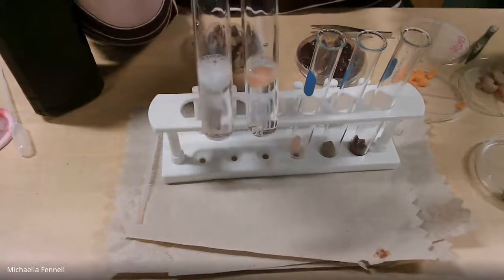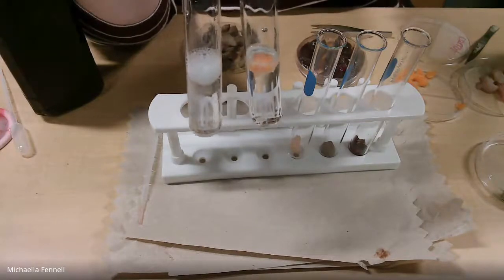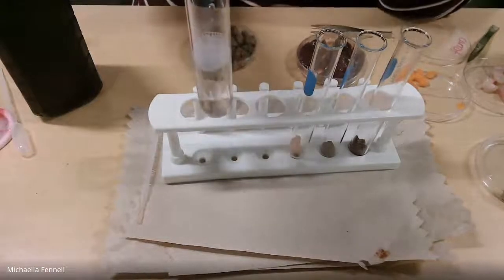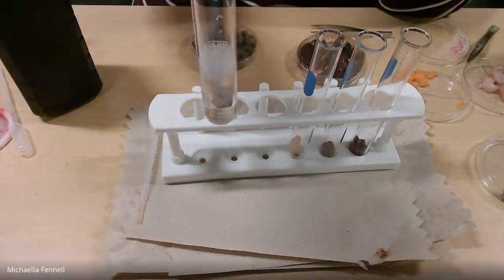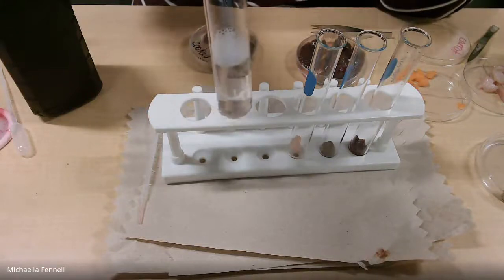And look, it makes the potato go up and down, by the way. The bubbles attach to the potato piece and raise it up, and then it sinks. Watch, it'll sink, then the bubbles attach to it and make it go back up again. Kind of interesting. All right.